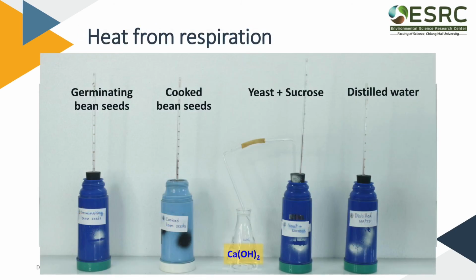Heat is generated from the respiration process. In this experiment, we are going to determine the heat generation from respiration of germinating bean seeds, cooked bean seeds, yeast suspended in sucrose solution, and distilled water.